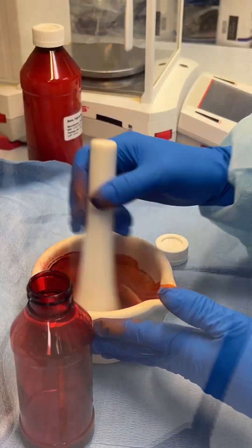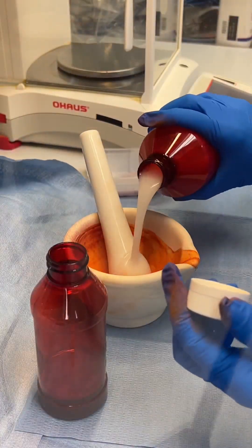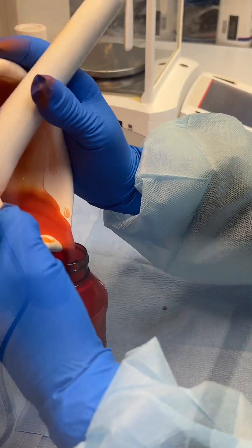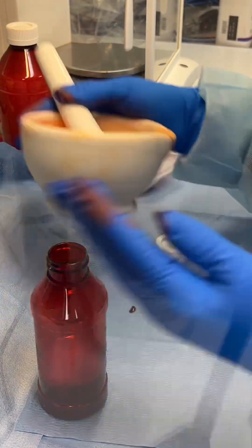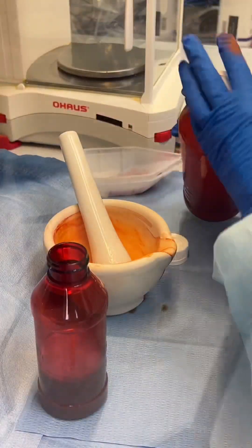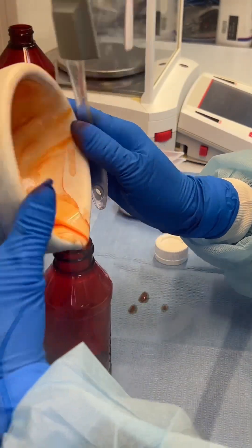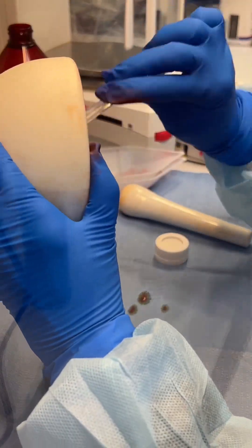After adding that to the prescription bottle, we will rinse our mortar and pestle three more times with our suspending vehicle. We will then scrape our mortar and pestle to make sure that all of our active ingredient gets into our prescription bottle.